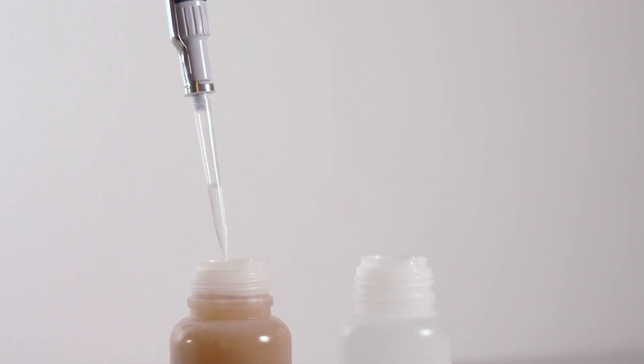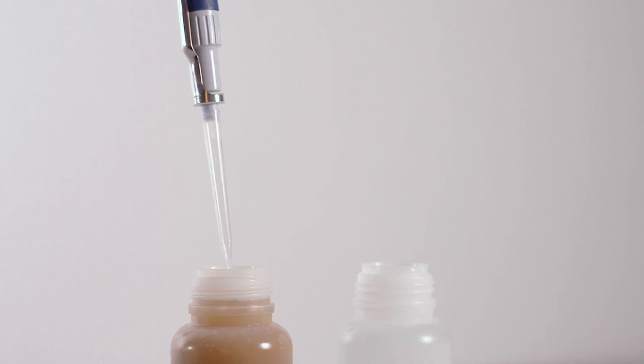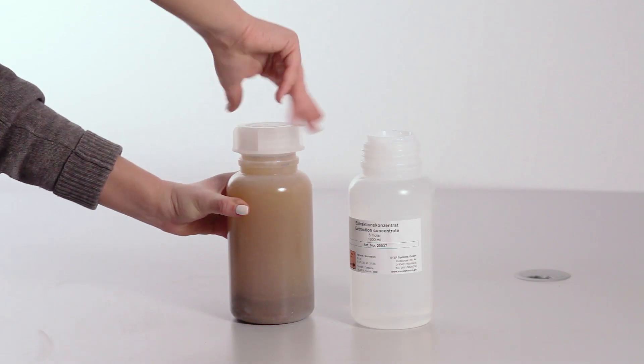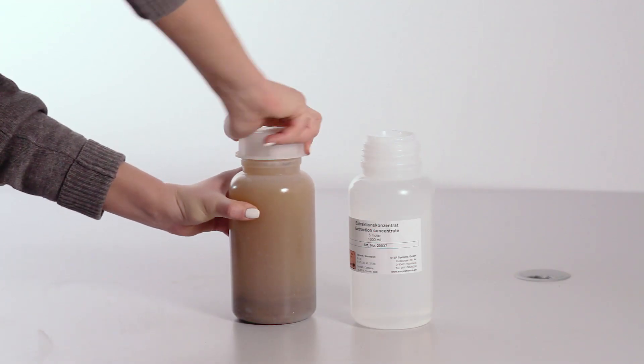The last step of the extraction is adding 10ml of extraction concentrate to the solution, then mixing it and letting it settle for one hour.